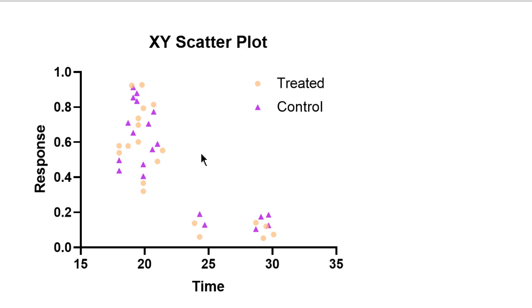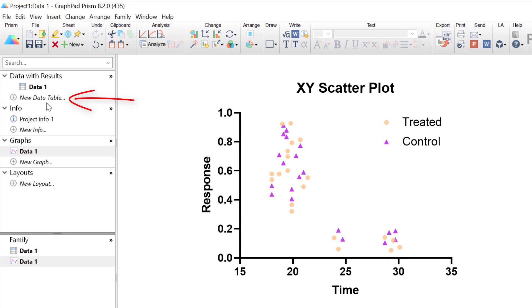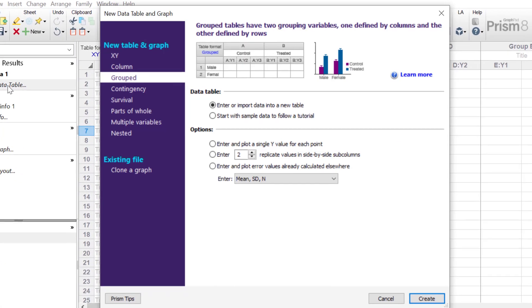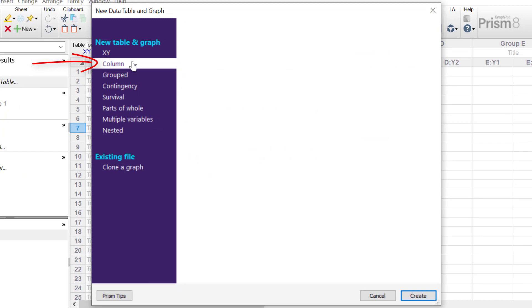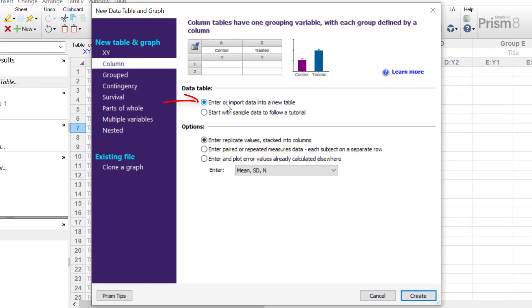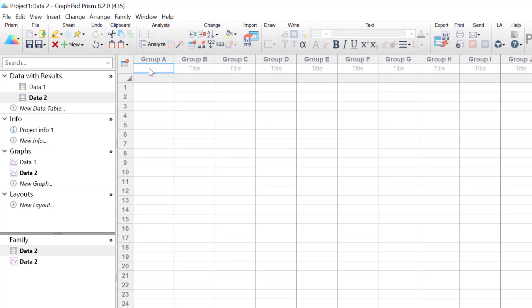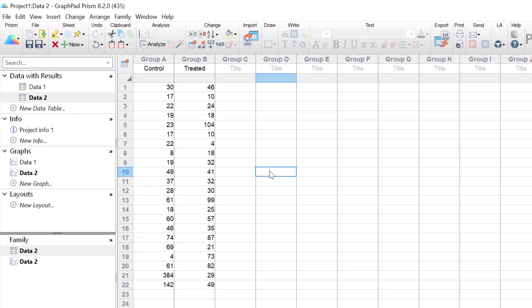Let's now go ahead and create a column scatterplot. In the left-hand window I'll create a new data table, select column, enter or import data into a new table, enter replicate values stacked into columns, and click create. I'll paste in the data prepared earlier — this is from an experiment with control and treated groups where an activity value is measured, and each replicate is stacked into each column. There are 22 measures in each group, or 22 replicates.